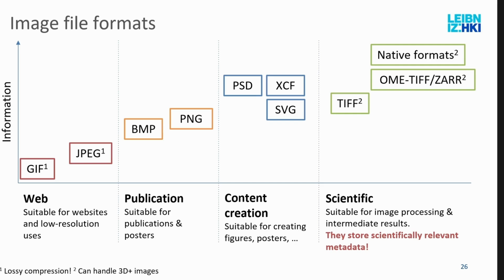Then there's one step up from TIFF: the OME-TIFF standard. It's basically an extension of TIFF designed really for microscopy work, where it can store a lot of the metadata that your microscope produces, and the people who develop this format work together with the microscopy manufacturers so that the data is stored there, standardized and properly organized.